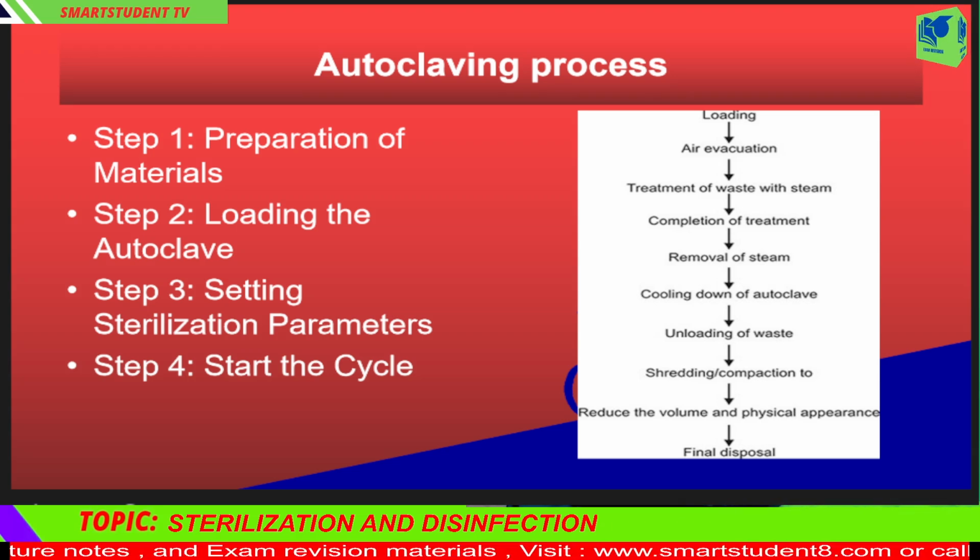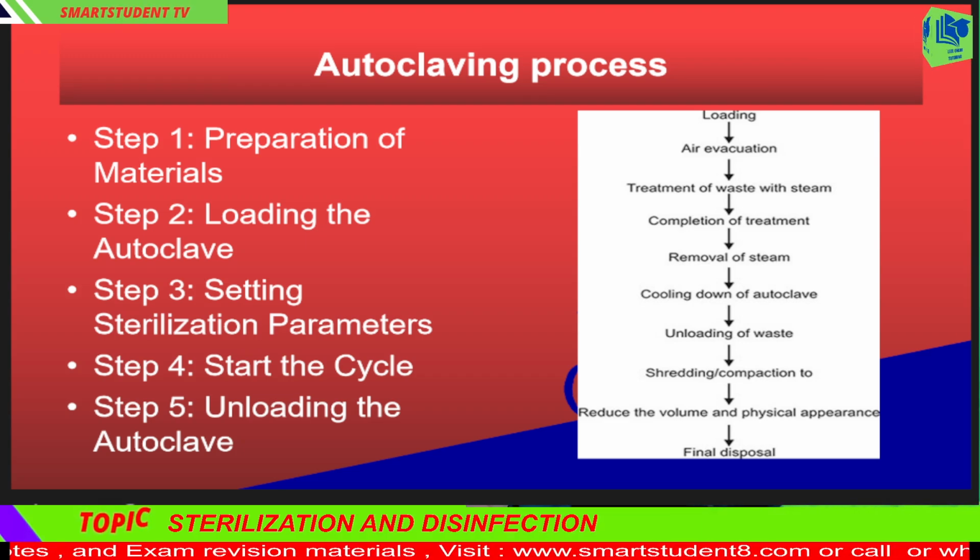Step 5. Unloading the autoclave. Allow the autoclave to cool before opening. Open the door slightly to release residual steam. Carefully remove sterilized materials using heat-resistant gloves.